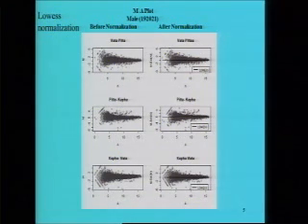So we use a very well known technique of lowess normalization for taking care of dye bias, to reduce the impact of dye bias. So we carried out the lowess normalization on MA data for all these arrays, and then the right panel shows the result after this effect of dye bias is reduced to a certain extent.